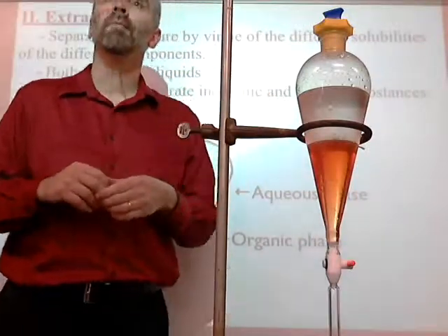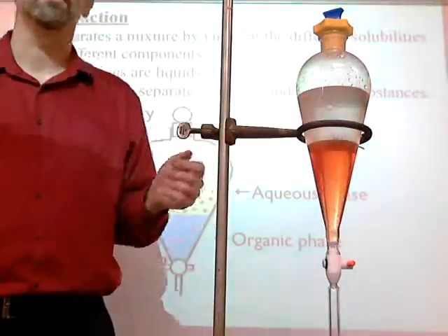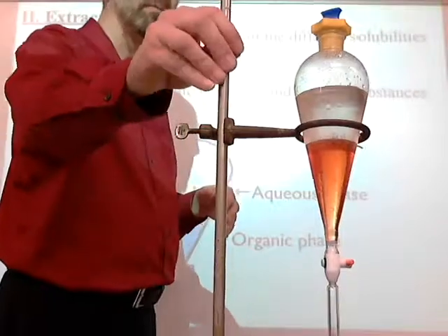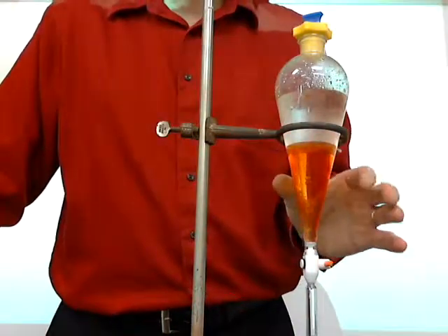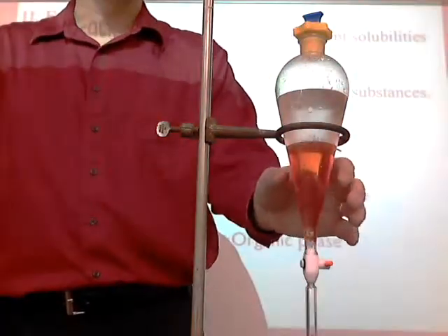Why is the top part cloudy now? It's just because you shake up water, it's going to get cloudy. I don't think so. Anyway, shake up water. I can't see this tomorrow when I'm doing the caffeine, but right now I can see that the red is down here.